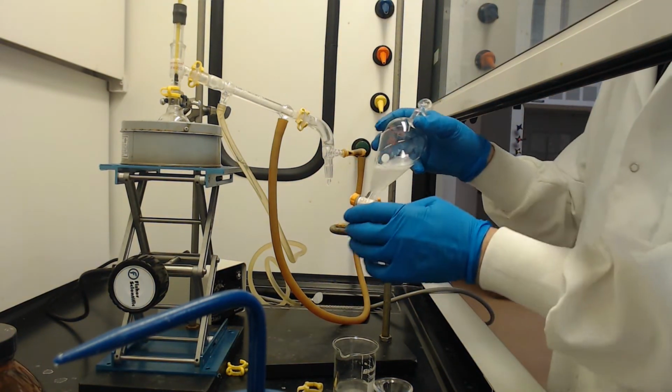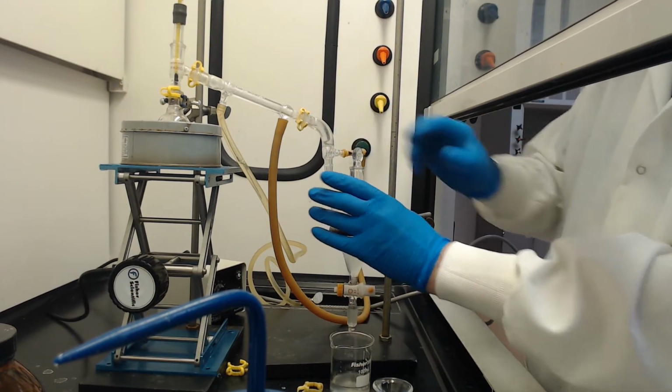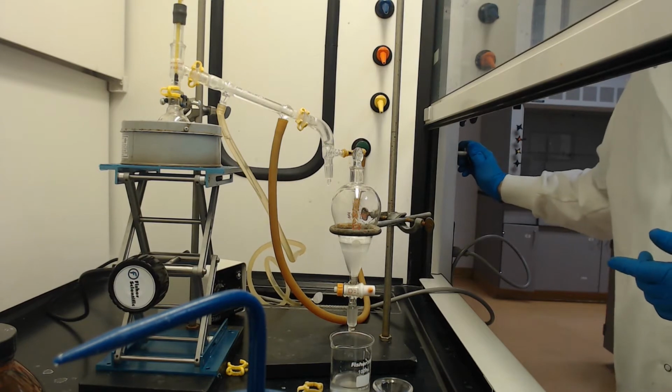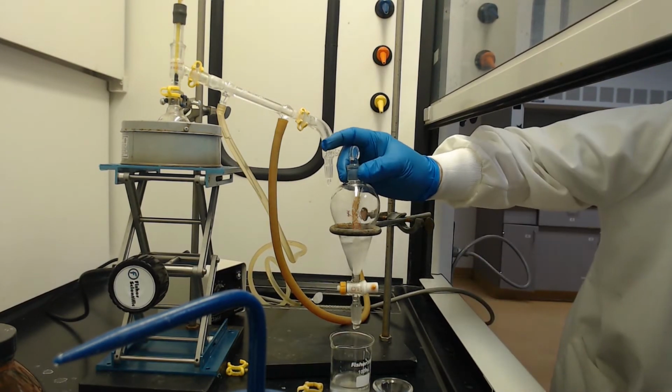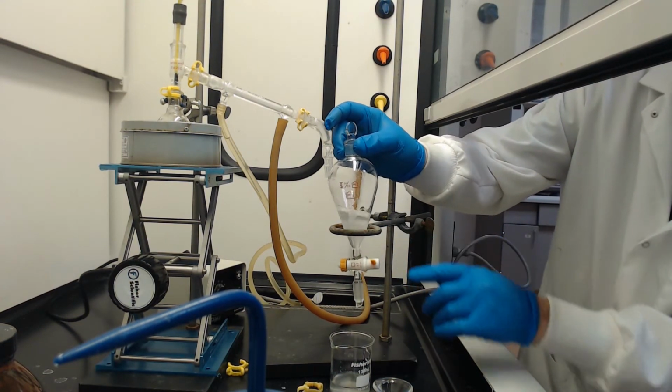Put it back here, let it rest, let that emulsion settle out. And I forgot to turn off my water. I can hear it going, so I'm going to turn off the water. It's a desert out there, so we want to save our water. So you can see these air bubbles here. We're going to let those kind of rest out.